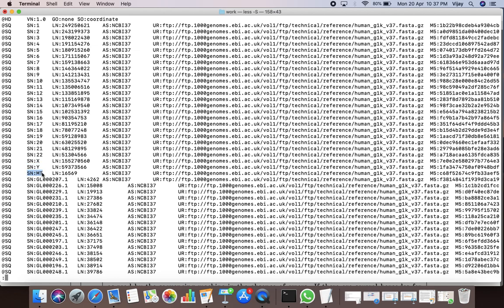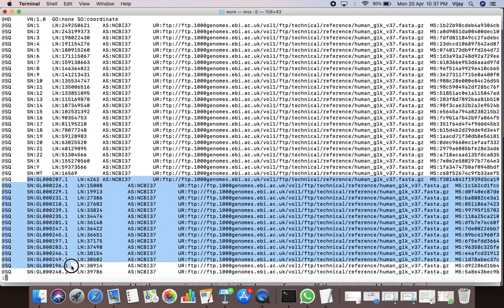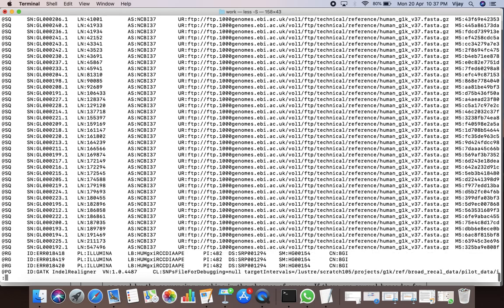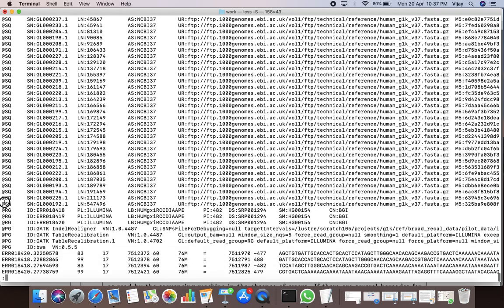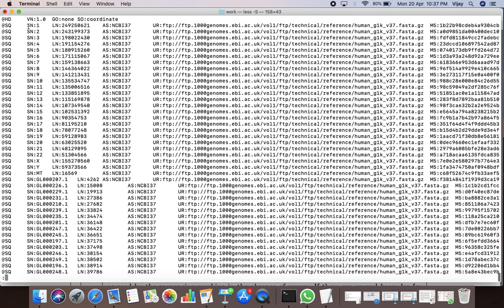Mitochondrial chromosomes were also used as a reference sequence to align read sequences. In addition to this, there were several other sequences used in this example as a reference sequence. The SN tag value is 1 for this particular line, indicating the name of the reference sequence is 1, representing the first chromosome.